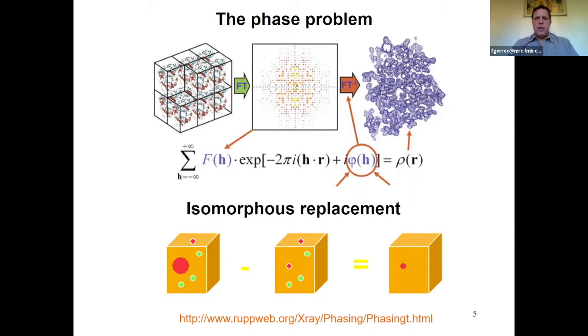So historically, an experimental method to deduce the phase is isomorphous replacement. This is the initial protocol developed by Max Perutz in the 60s. Why I'm mentioning this approach is because you will need some crystallization efforts to do that, because you need to obtain the exact same crystals as previously, but with a heavy atom, a metal, integrated into it after soaking.